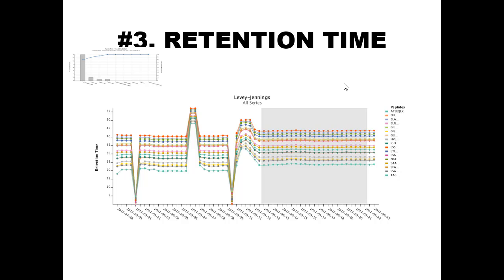Already in there, and that would effectively be a second thing AutoQC is doing. So a lot of people will use something that they were maybe doing manually as a starting point, and then use AutoQC to increment beyond there. Yeah, it's a good point.